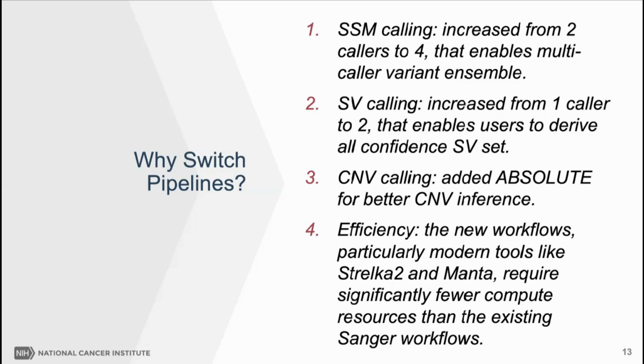In response, we are introducing this new workflow using a combination of GATK4 CNV and ABSOLUTE, which allows more accurate and robust CNV inference, particularly for complex genomic regions.